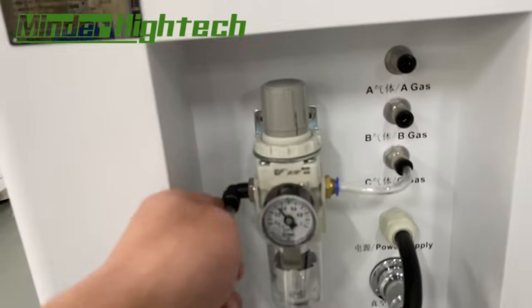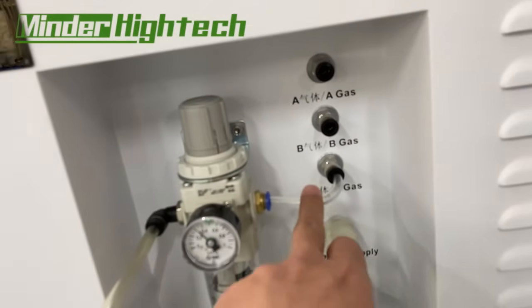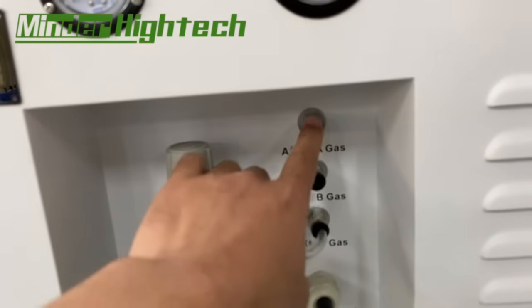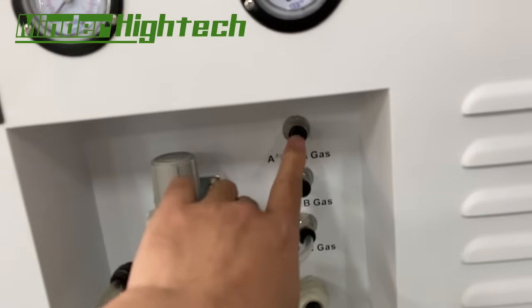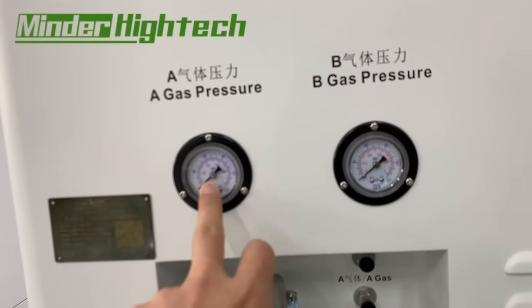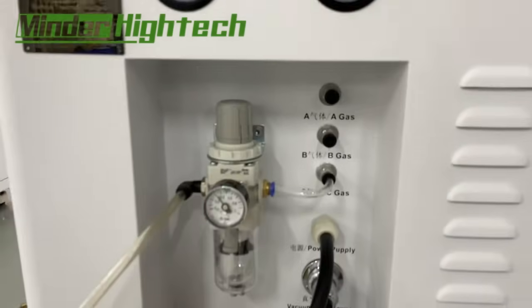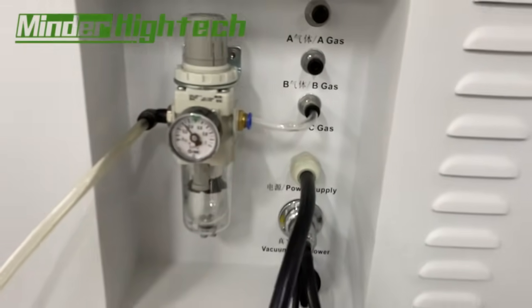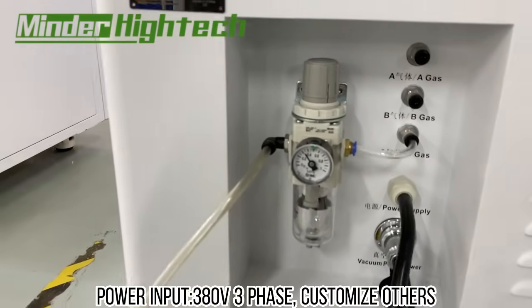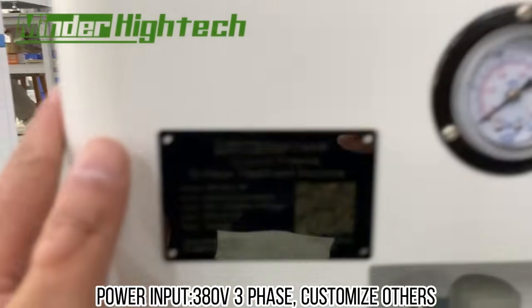This is the air source. The air source is used to balance the vacuum. Here is the process gas A and gas B, with a meter for each. And here is the main power supply — it is 380 volts, as you can see on the lamp plate.